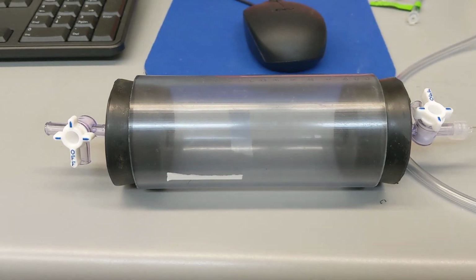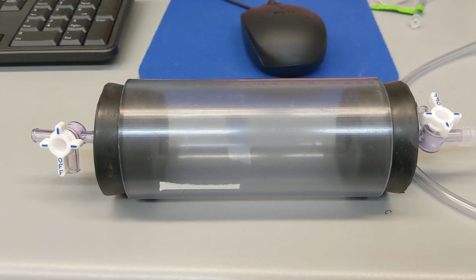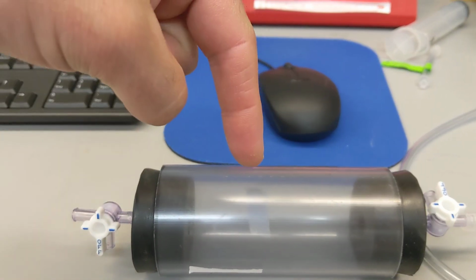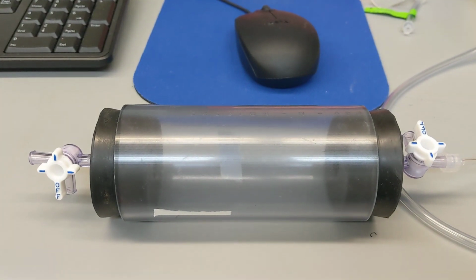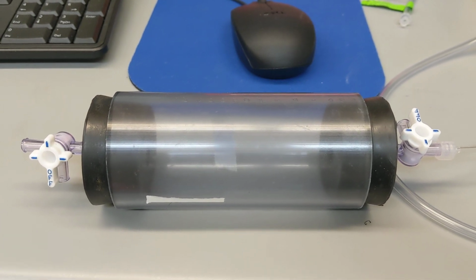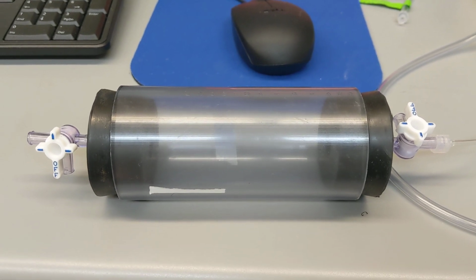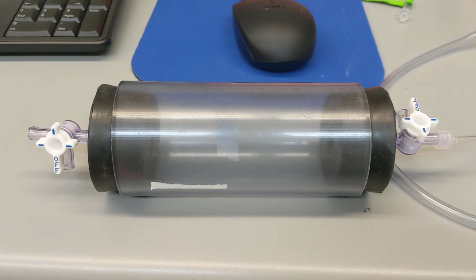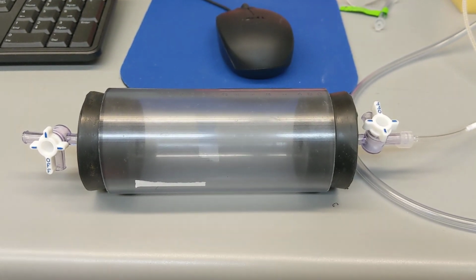And the idea behind this sealed metabolic chamber is that we know the concentration of oxygen in atmospheric air, 20.94. There's an animal inside of this chamber, which there isn't right now, but if there's an animal inside of this chamber, that animal is using oxygen for its own metabolic rate. So what we can do is put an animal in that particular chamber, collect data on the percentage of oxygen that's in that chamber, and compare that to the value taken from an empty chamber, which is going to be 20.94.